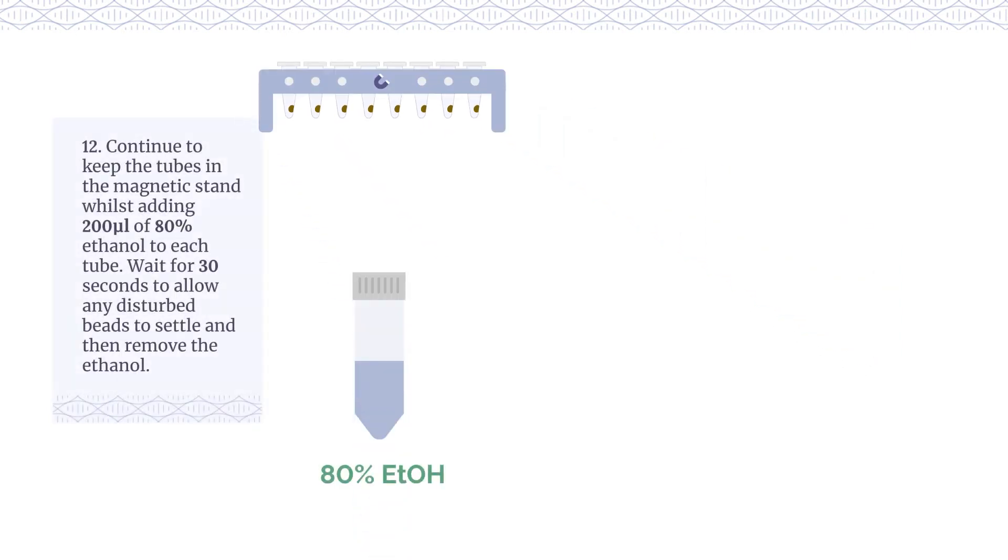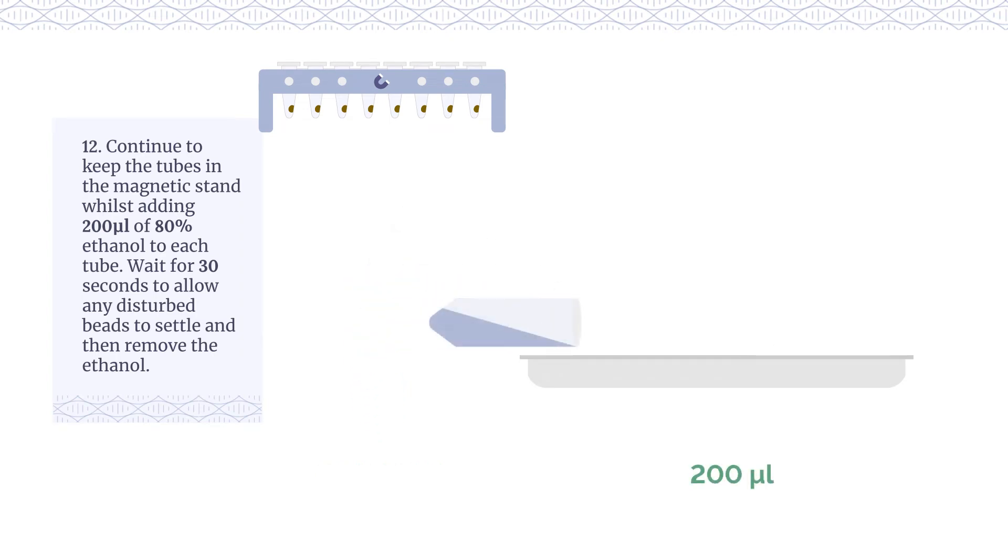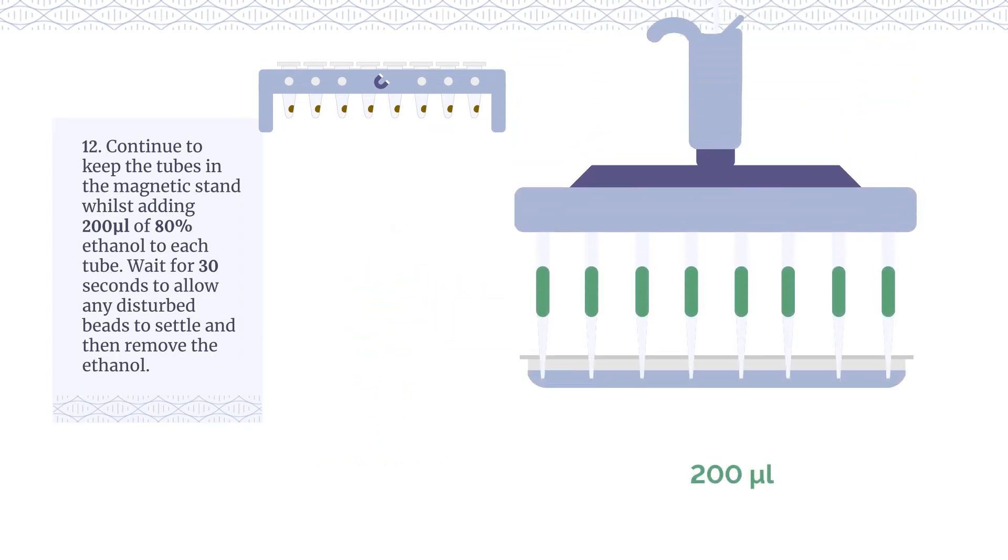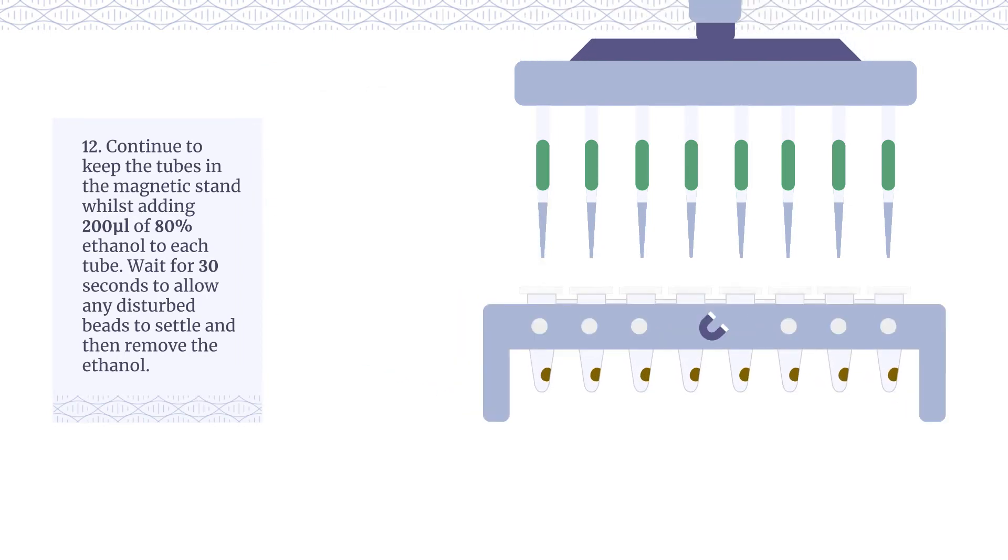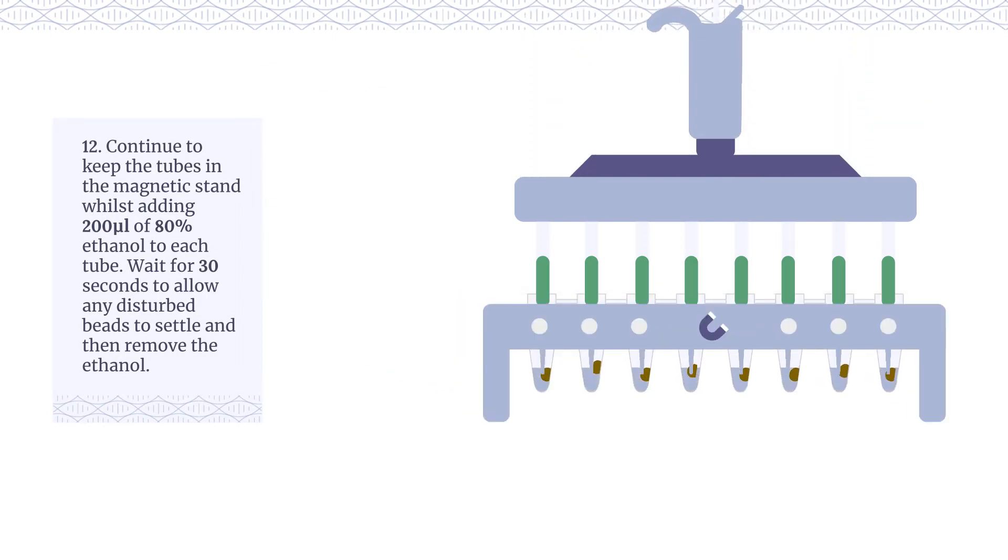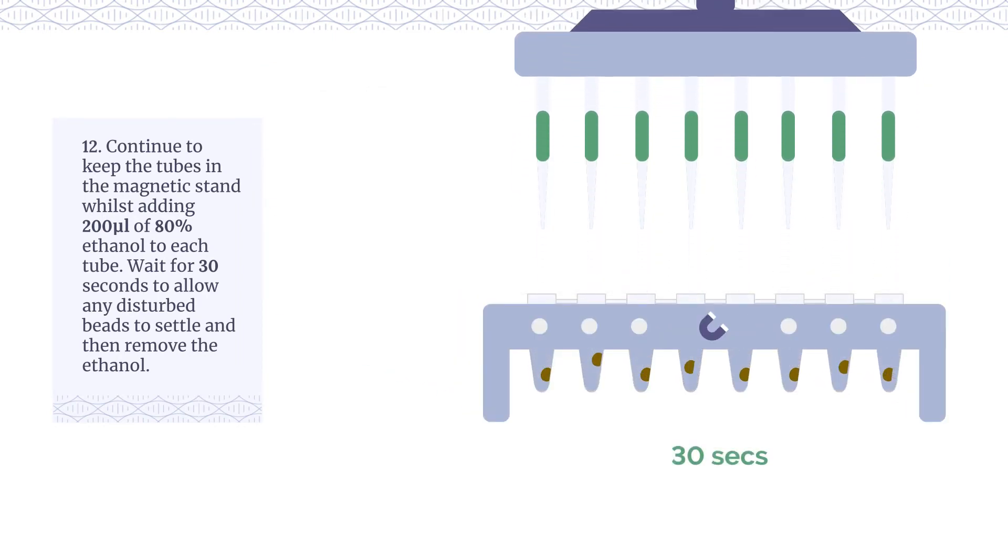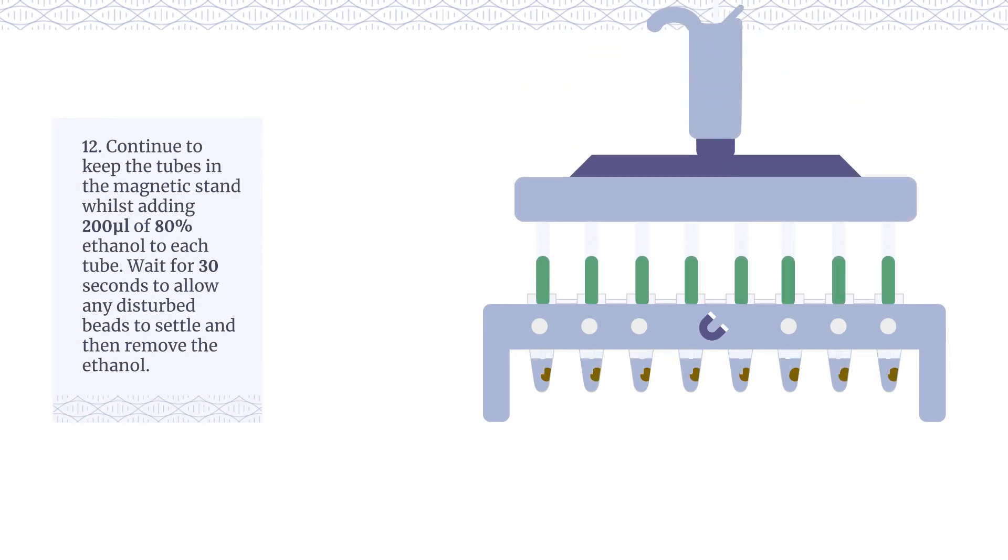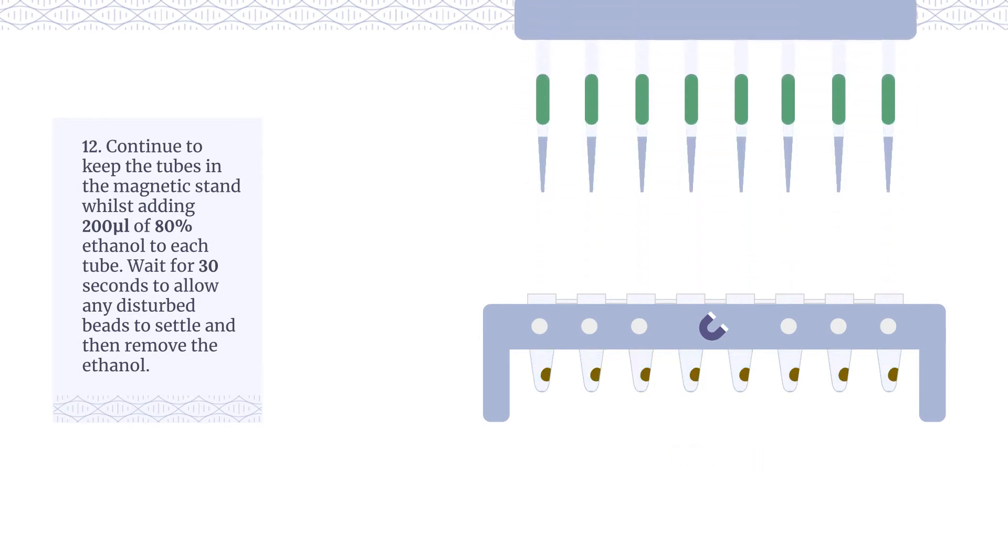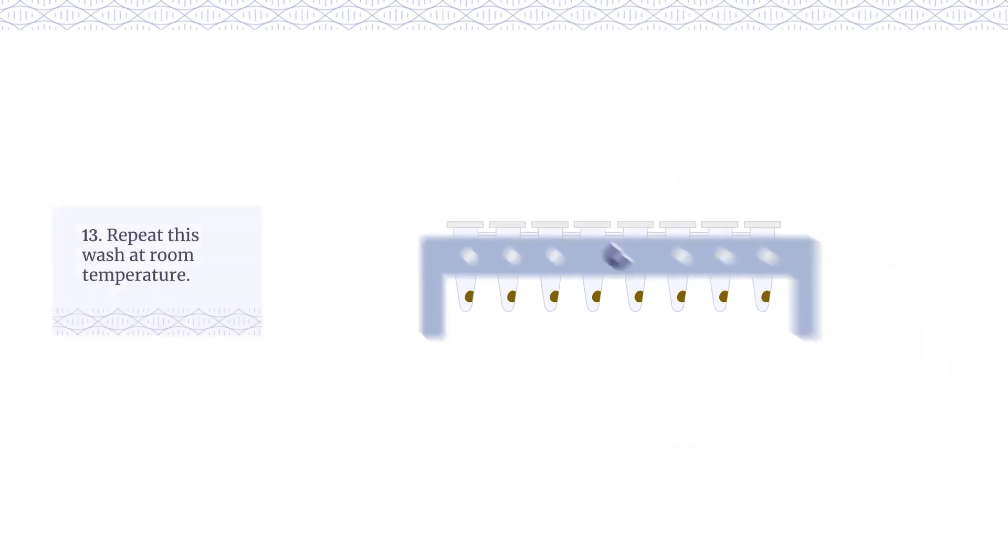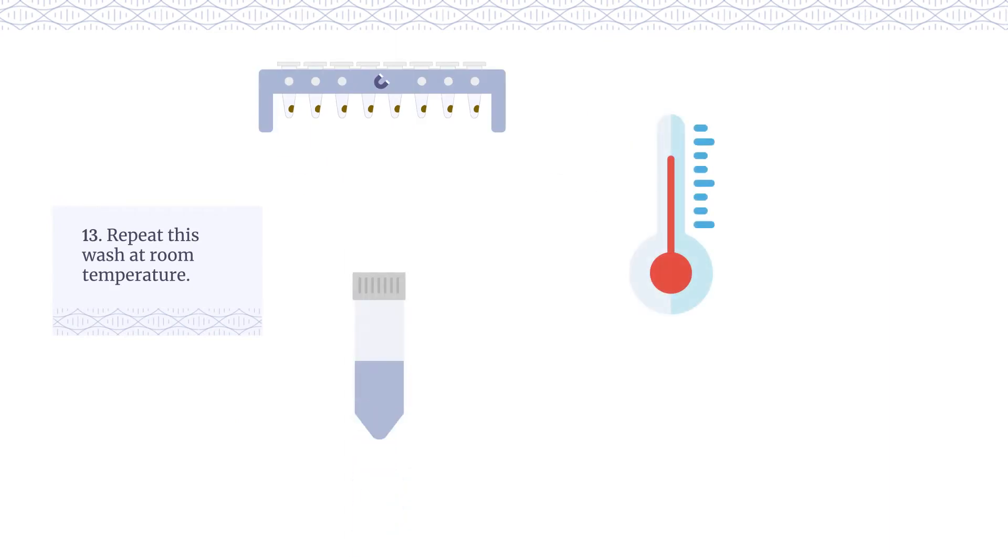Continue to keep the tubes in the magnetic stand whilst adding 200 µL of 80% ethanol to each tube. Wait for 30 seconds to allow any disturbed beads to settle and then remove the ethanol. Repeat this wash at room temperature.